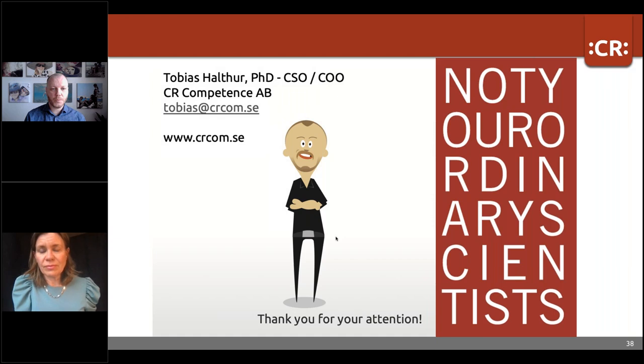Ellipsometry is also a bit sensitive to structured layers, actually. It's based mainly on the assumption that you have an isotropic layer on your surface. So if you start to have crystal structures, you could get different refractive index and response depending on the orientation of your layer. It might be possible to see those types of things with spectroscopic ellipsometry, but SAXS would be much more straightforward.